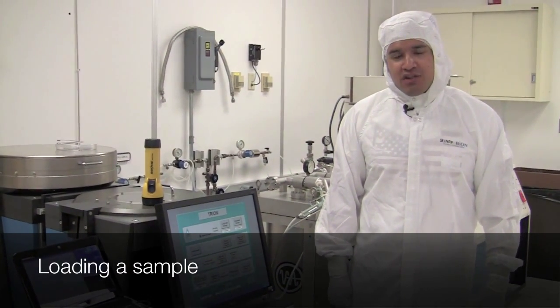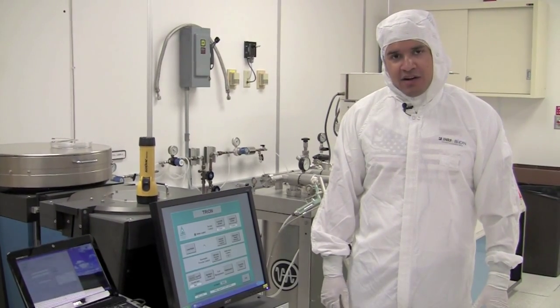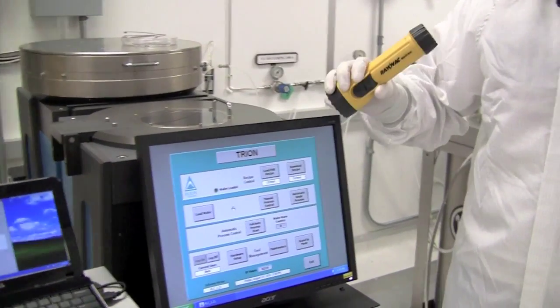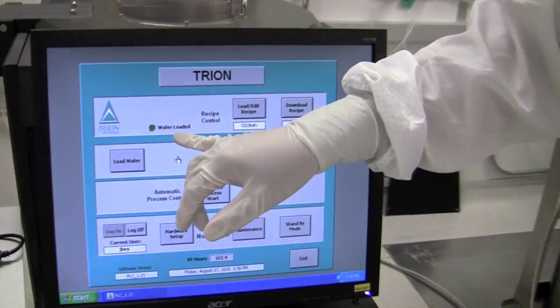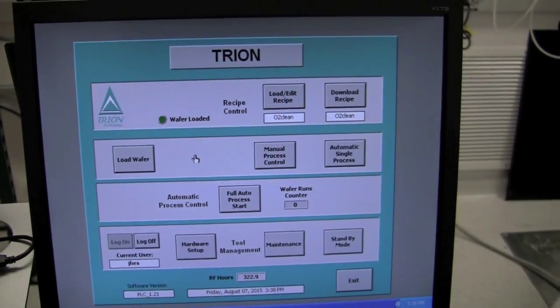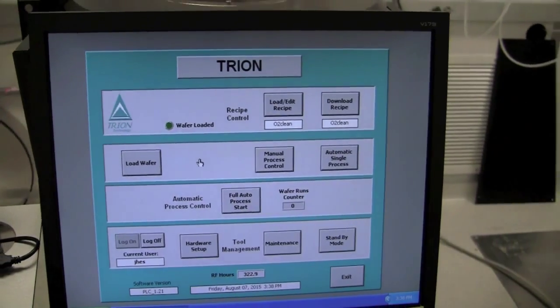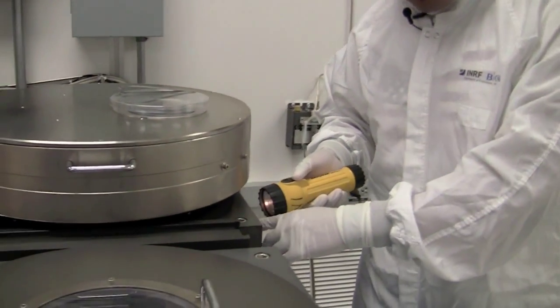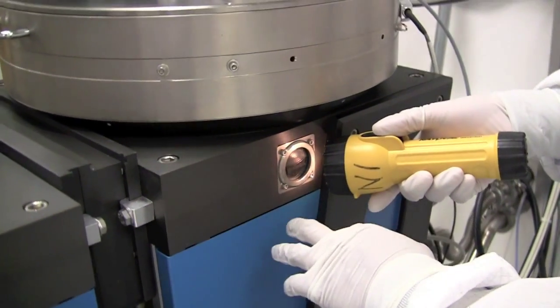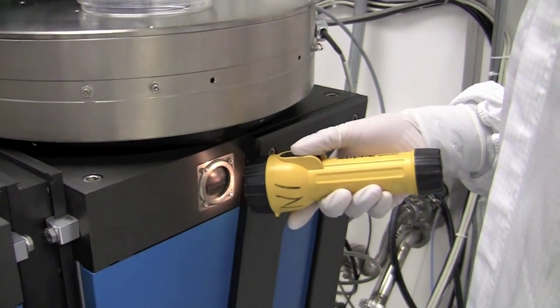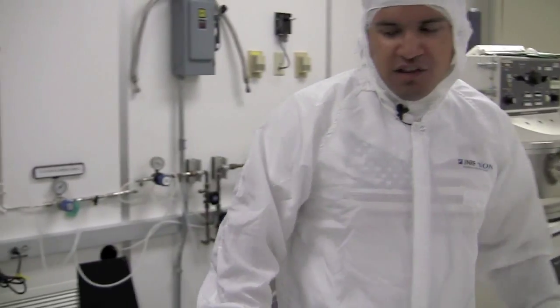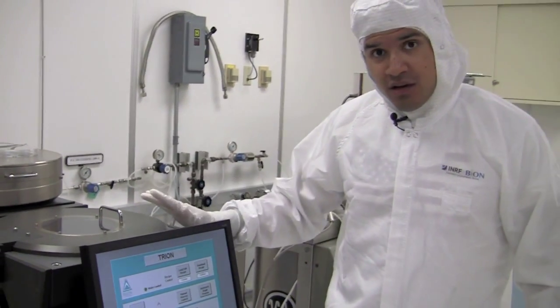Welcome back. So, now that we've returned from the chase and made sure that all the gases and the pumps and everything is operational back there, we're ready to start using the tool. So, to load a wafer, first we want to make sure that there's no wafer already loaded. Sometimes the tool, even though it's supposed to indicate whether the wafer is loaded or not, may have wafer in there. So, you want to just briefly peek into the chamber with a flashlight. It's hard to show on the camera, but I'm just going to demonstrate how you would do it. You get a flashlight, there's a window here that you can poke and look in there to see the wafer is loaded. So, just check there and make sure there's no wafer. We already checked, so there's no wafer right now, but that's how you would check. You have a flashlight that's available at the front office or just laying around, you might find one.